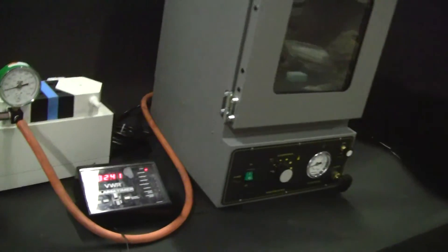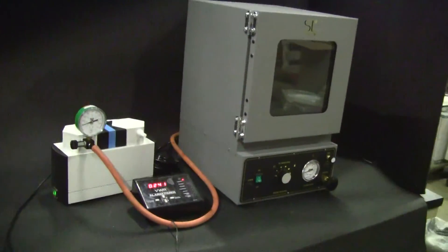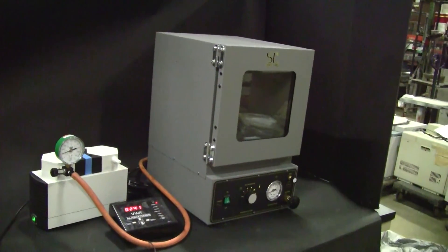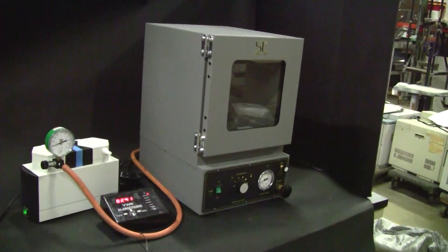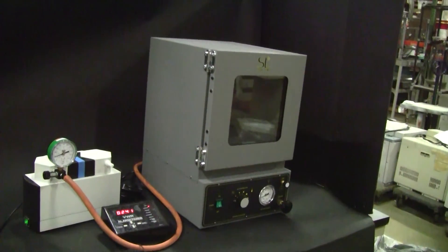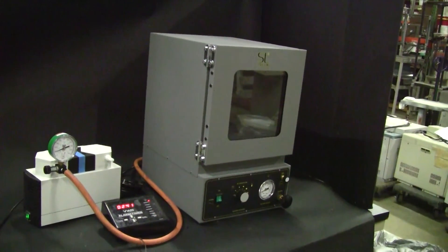So 2 minutes, 40 seconds, the lab port pump plus the vacuum oven. What a wonderful instrument for the laboratory. 609-518-9100, thank you from hightechtrader.com.